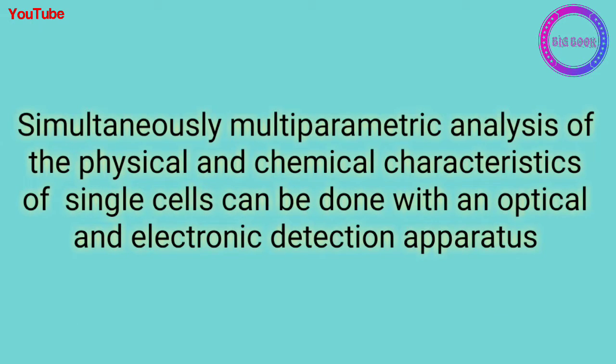Here we can understand each and every cell, its size and whatever the nature of that cell, depending upon certain parameters which have already been placed in the computational system, that is the analogs or the detectors which are connected to the computer system, where we are going to get the results accordingly.